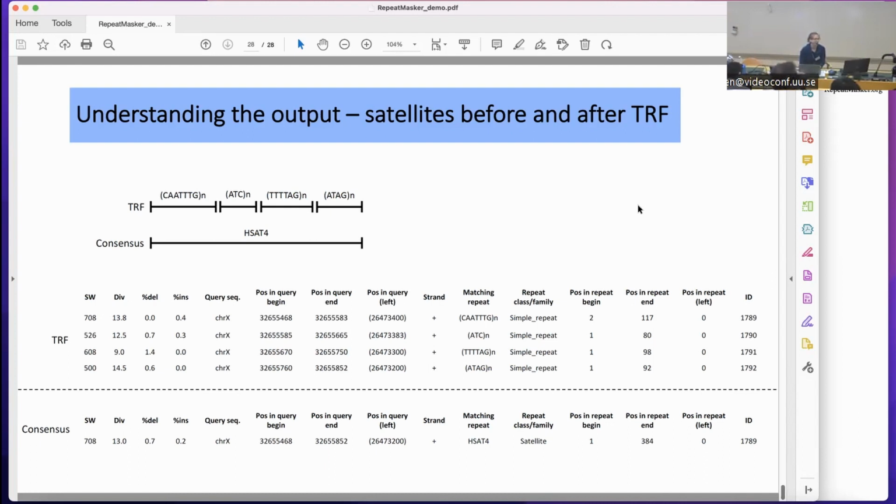They worry about the SW score. Worry how? What do you mean by worry? If it's low or high. So generally false positives are going to be below, it depends a little bit on the match, but generally below 250 is a false positive. They're talking about the Smith-Waterman score and being concerned. Typically below 250 is a false positive.